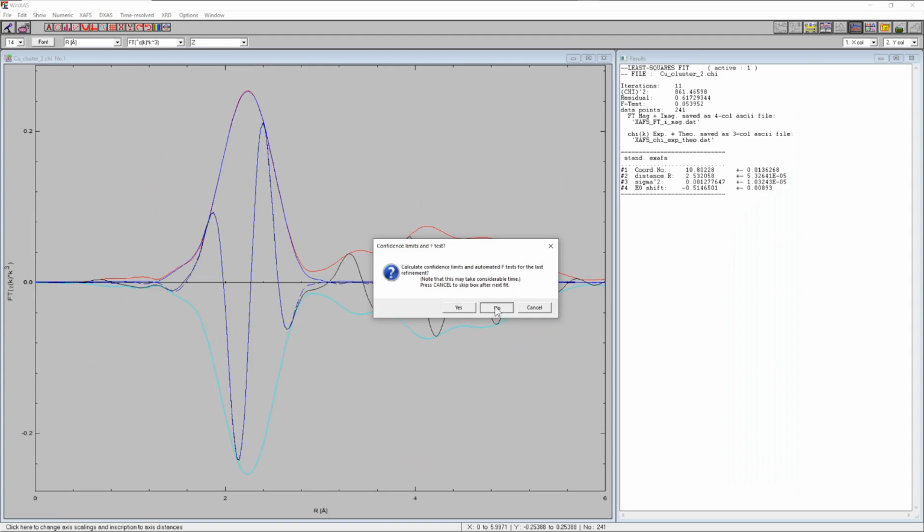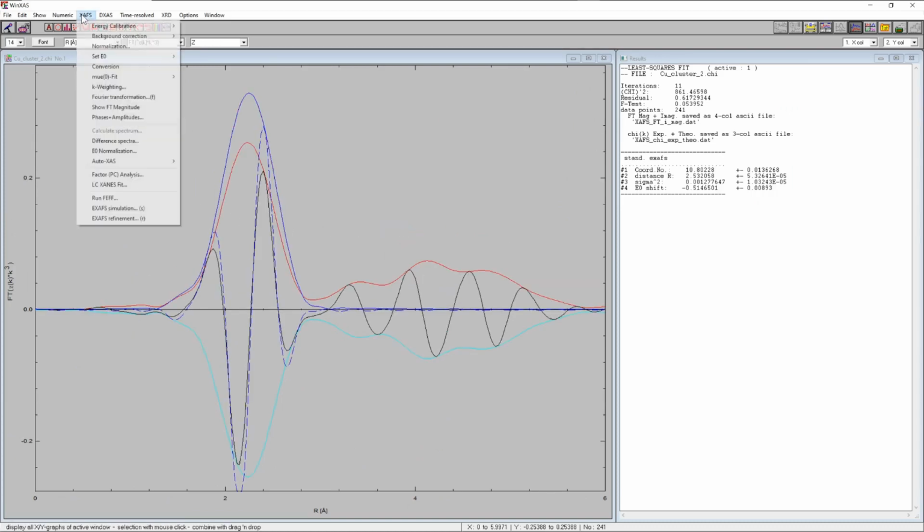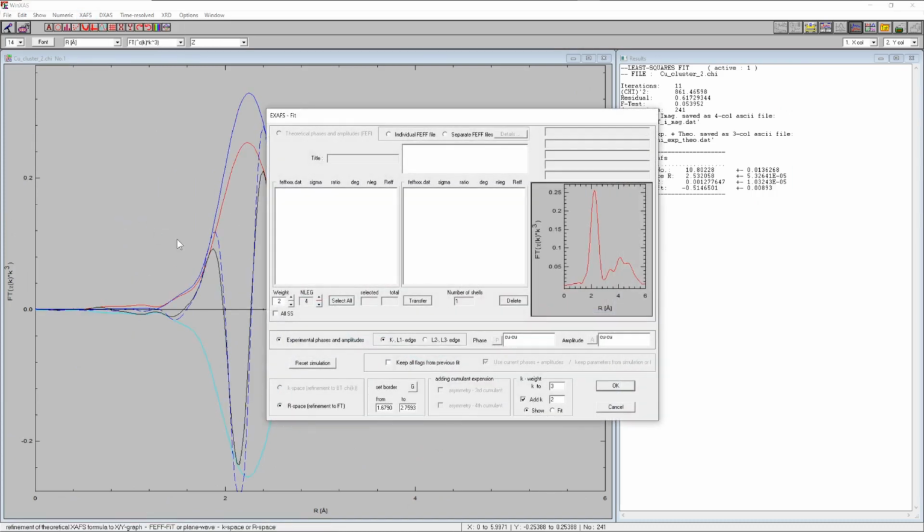And in this case, no, we do not want to calculate those again. So we can restore parameters and we can perform this refinement again, now with not just showing the additional k-weighted radial distribution function, but instead performing the refinement to both radial distribution functions. So performing the refinement to the k-cube and k-square weighted radial distribution function at the same time.